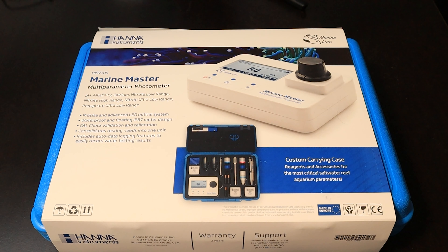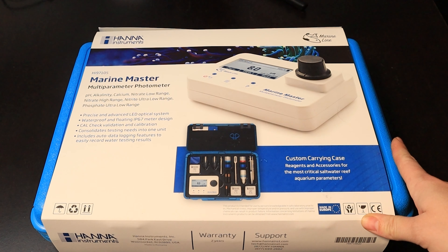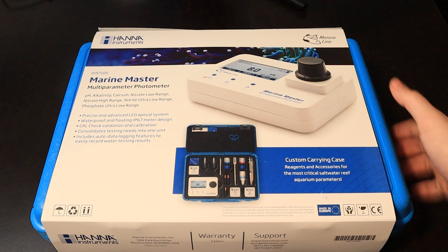I do like this one because it's going to be able to keep your results for up to — I think it was ten tanks — and I have four in my house, so we'll be able to go back and read all the results that we've done. Let me get this box opened up.